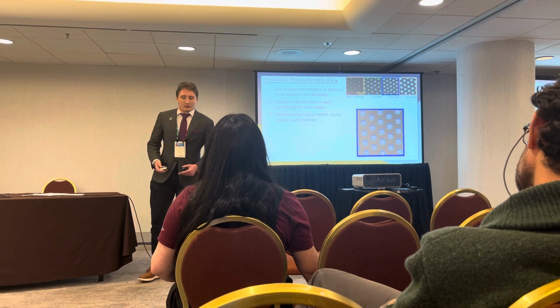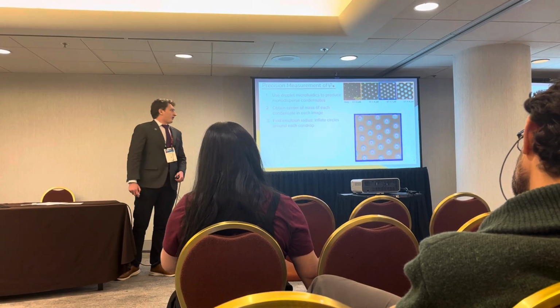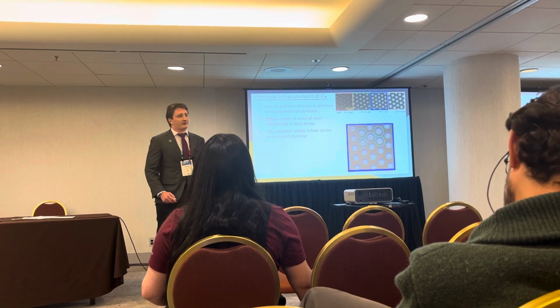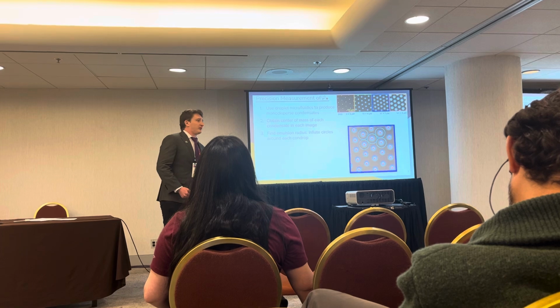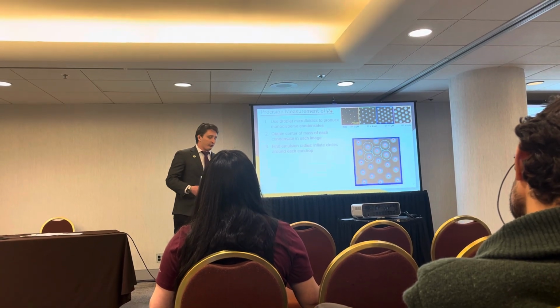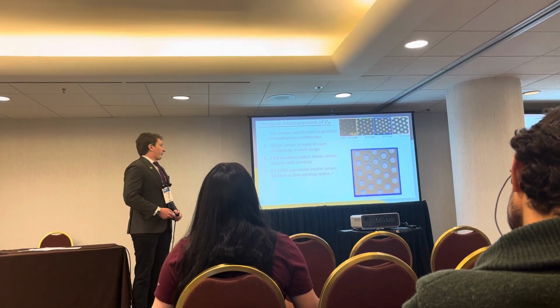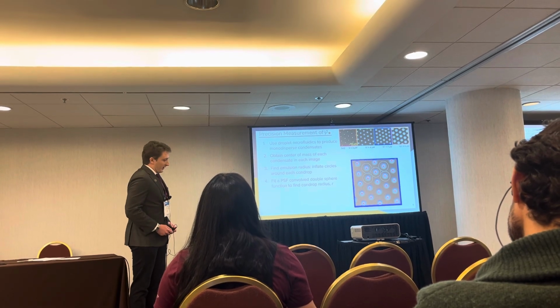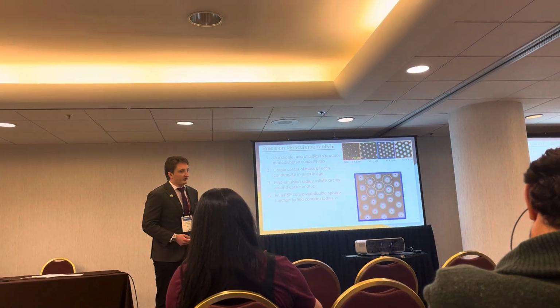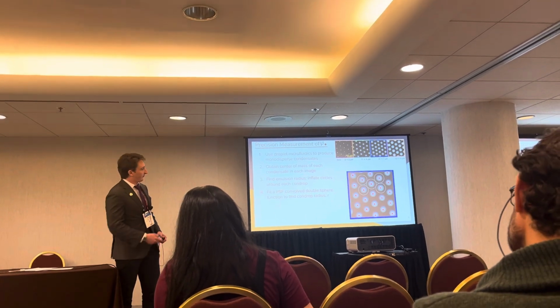Then we needed to find the outer radius, but I really didn't want to go through the headache of using a higher order functional form. So instead, we simply inflated circles around each of these centers of mass until they made contact. At that point, the algorithm was terminated, and we directly made a measurement of the outer radius due to the sphere packing geometry that microfluidics permits. We then measured the point spread function under the emission of Cy3, which is the fluorophore we're using. And we fit a double sphere function, knowing this radius, and convolved it with the point spread of the objective and chose the fit with the lowest residual. That gave us an accurate measurement of condensate radius.